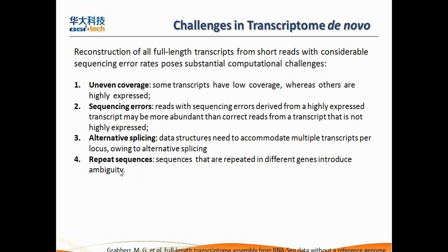Repeat sequences make it very hard to decide whether a part should be assembled into one contig, or located in different contigs. So these are several difficulties we face.